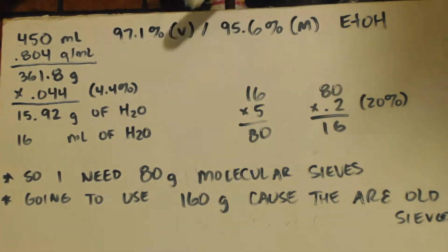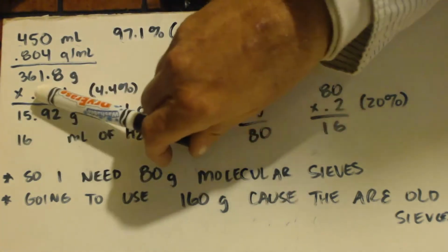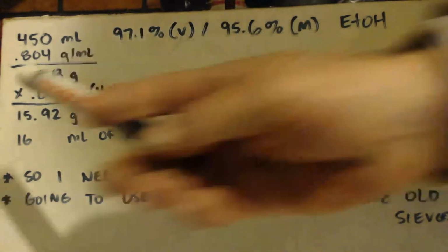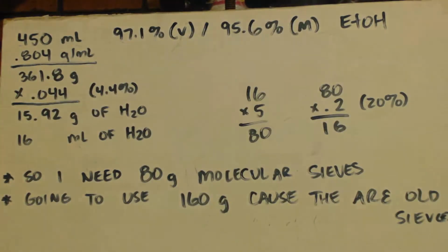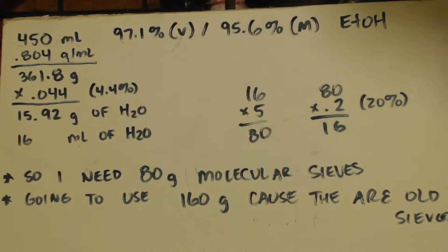Now, we can't use volume, remember, we got to use mass. There's 4.4% left of water and 95.6% of ethanol. So we took 4.4%, which is 0.044, and we got 15.92 grams of water, 16 milliliters. Because a gram is, you know, it'd be 15.92 milliliters, and we jack it up to 16 to have a nice rounded number.